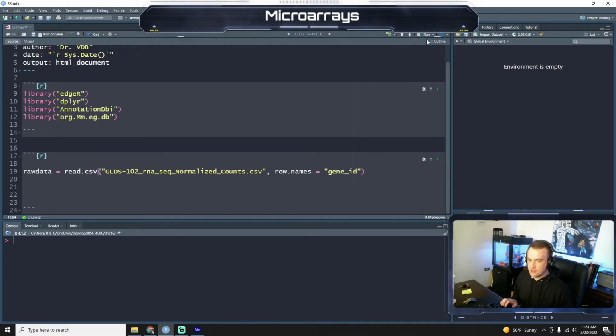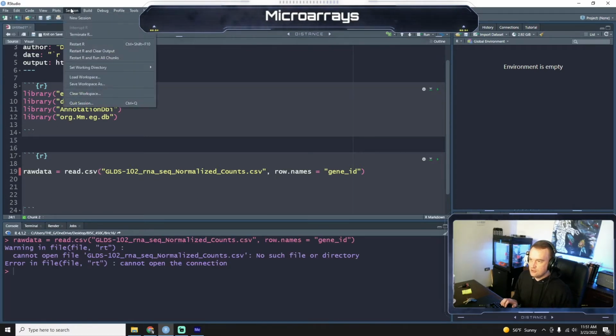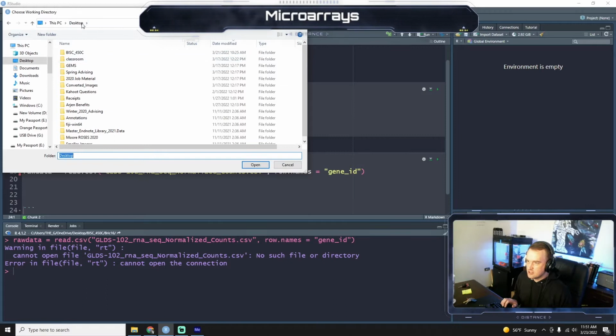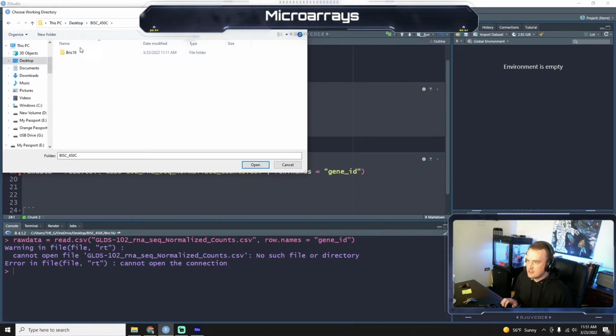So let's run this. Oh, so I need to set my working directory. For you, it's desktop, classroom, my files. I need to pick my directory. Hold on one second.